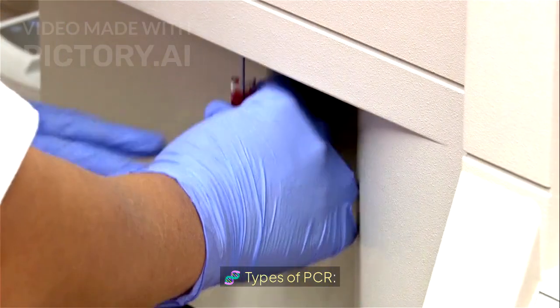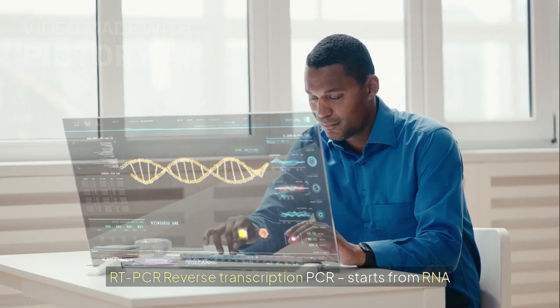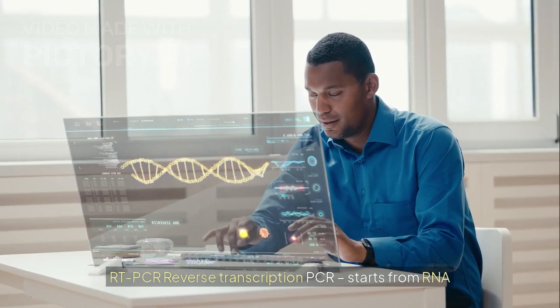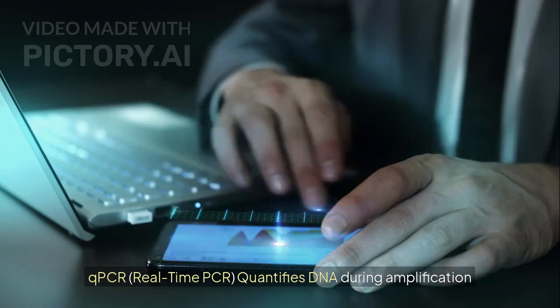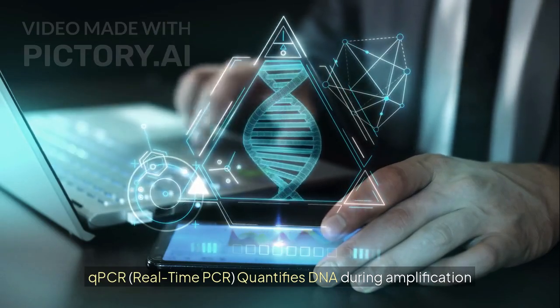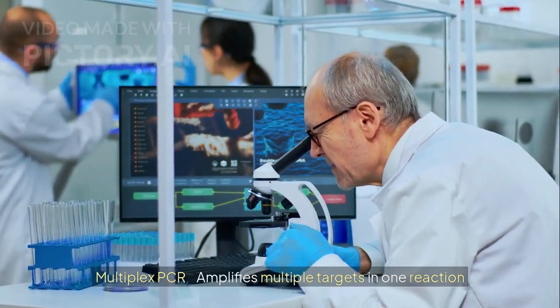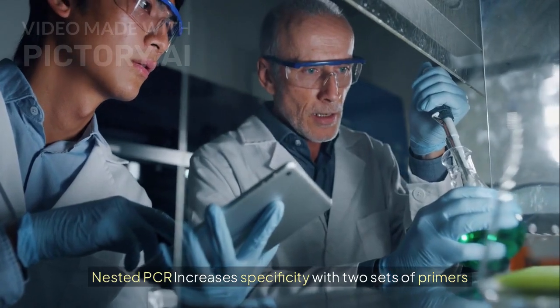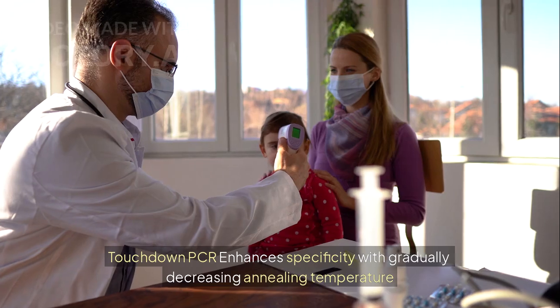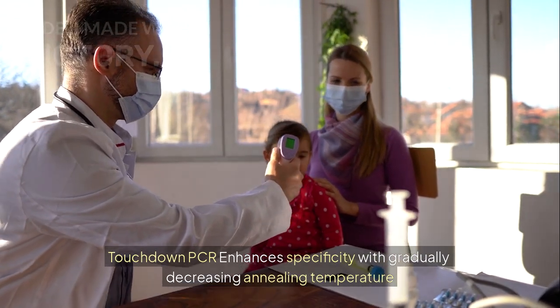Types of PCR. Conventional PCR: basic DNA amplification. RT-PCR, reverse transcription PCR: starts from RNA. qPCR, real-time PCR: quantifies DNA during amplification. Multiplex PCR amplifies multiple targets in one reaction. Nested PCR increases specificity with 2 sets of primers. Touchdown PCR enhances specificity with gradually decreasing annealing temperature.